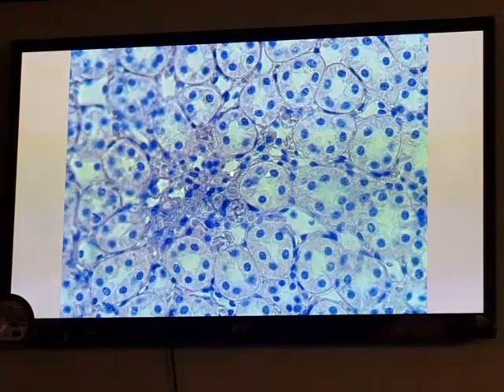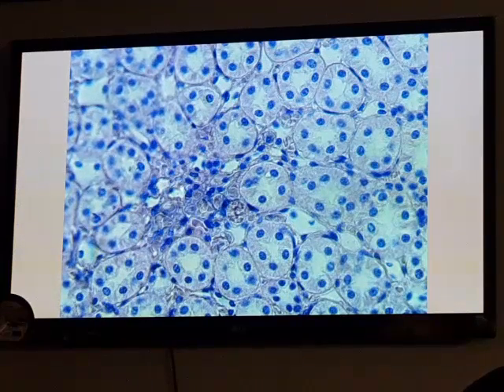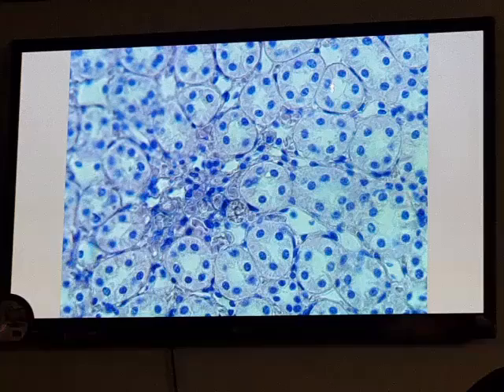This is a capillary, the smallest blood vessel. In this section, this blood vessel is called the vasa recta. This is another one. We can see only one endothelial cell in the lumen. This is another blood vessel, or vasa recta. Is the difference clear? This is a thick segment. This is the thin segment, and this is a capillary.